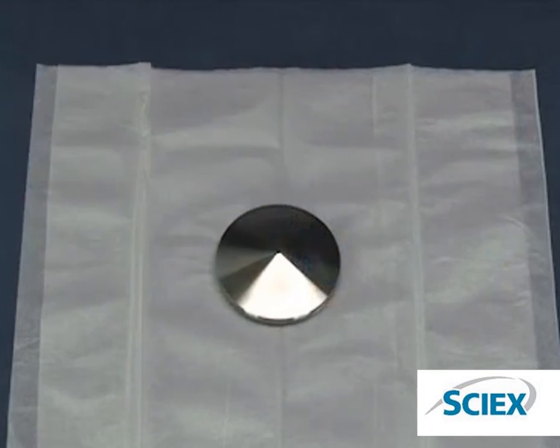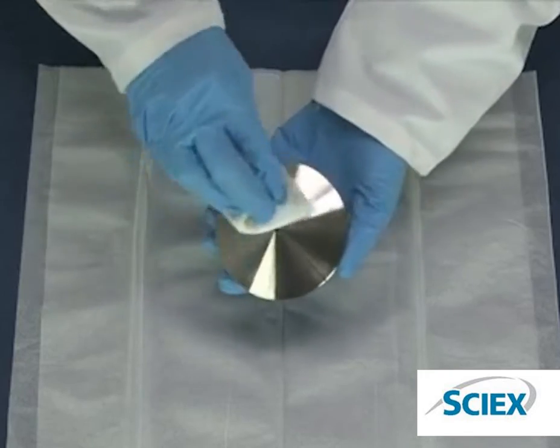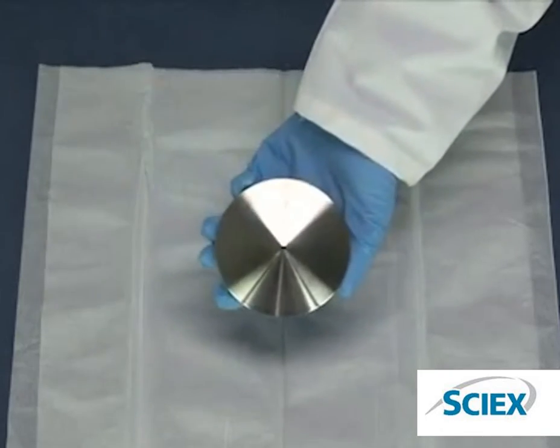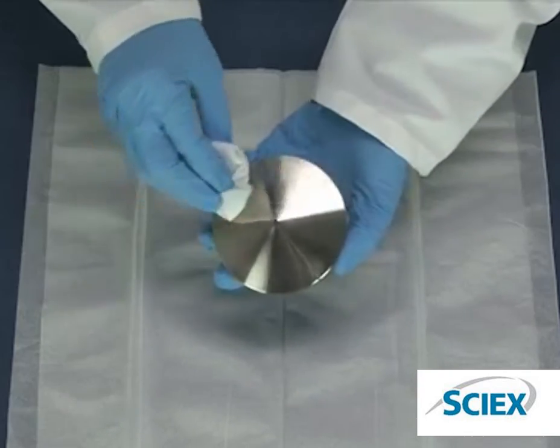Place the curtain plate cone up on a clean, stable surface. Dampen a lint-free wipe with pure water and clean both sides of the curtain plate. Repeat using the cleaning solution.